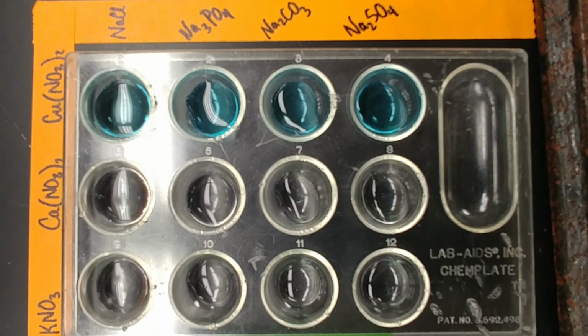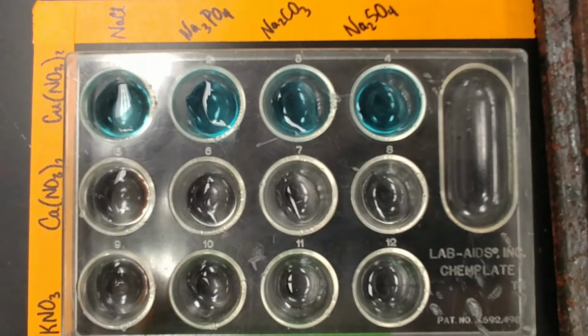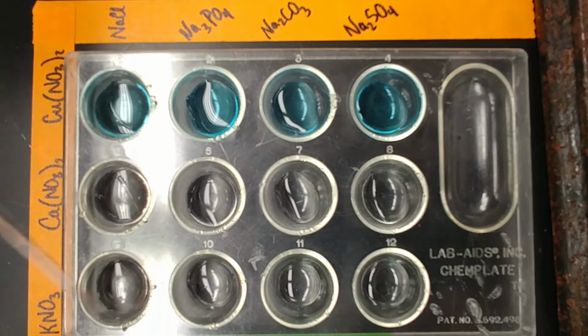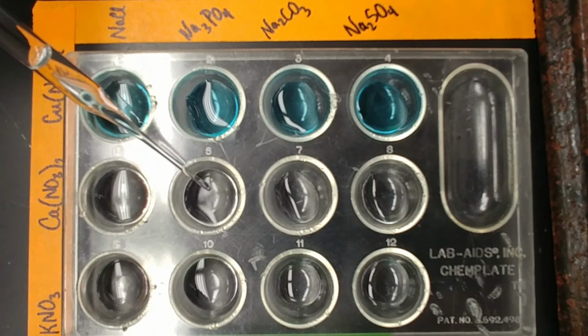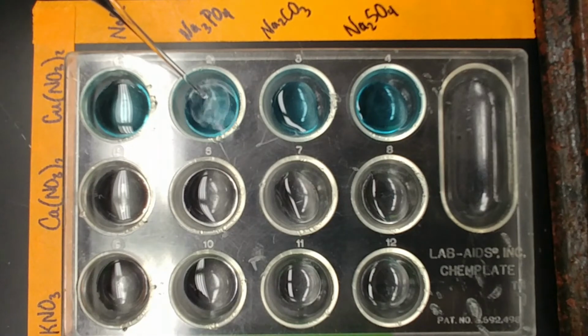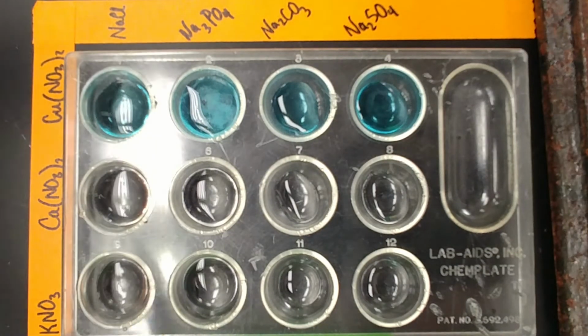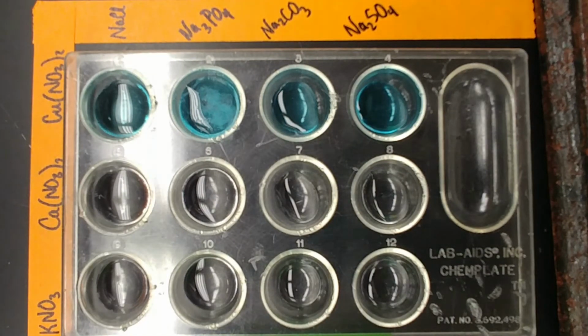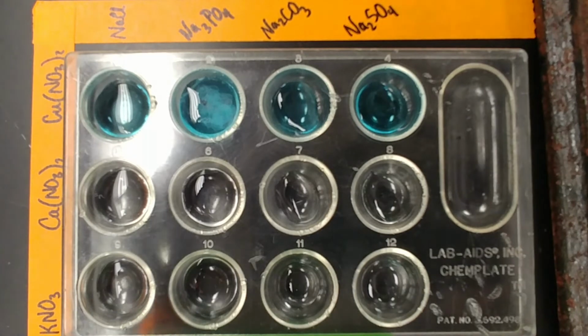And next we'll add the sodium phosphate. Next is the sodium carbonate.